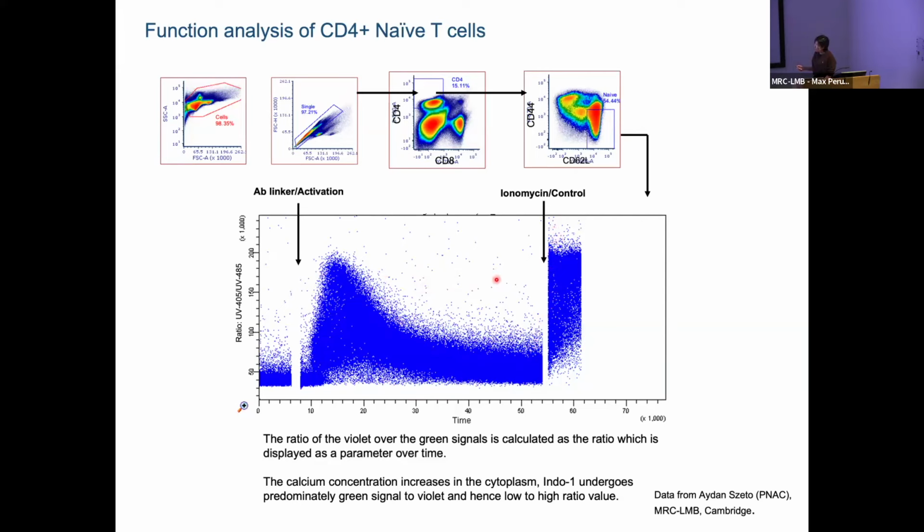If you want to do a calcium influx, come to talk to us. There are certain parameters on the software we can help you to set up. Usually you won't have this ratio automatically on the software, but you can add this ratio onto your parameters.